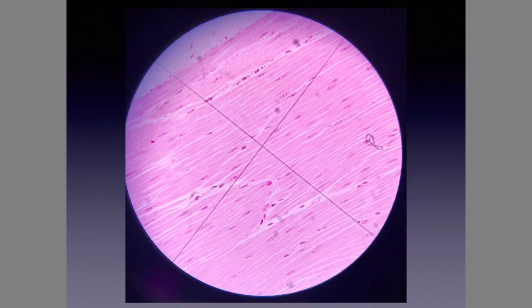Now we're looking at slide number two, and slide number two is a sample of smooth muscle. You have these shorter, thinner, spindly-shaped cells. They also only have one nucleus or uninuclear, unlike skeletal and cardiac muscle, which tends to be multinucleated. So this is yet another example of smooth muscle, and of course you had to identify this during lab exam one, so this is really a review up to this point.